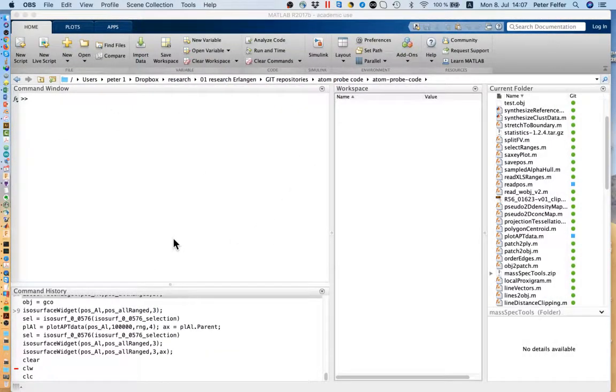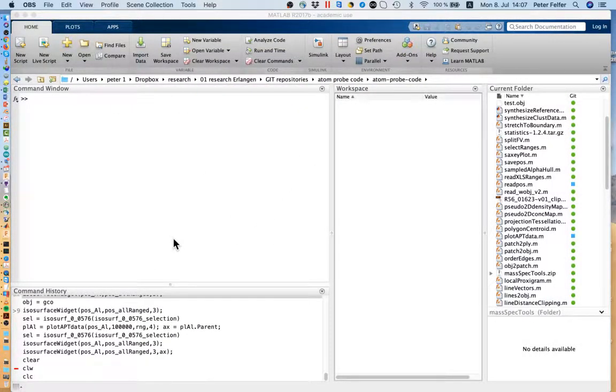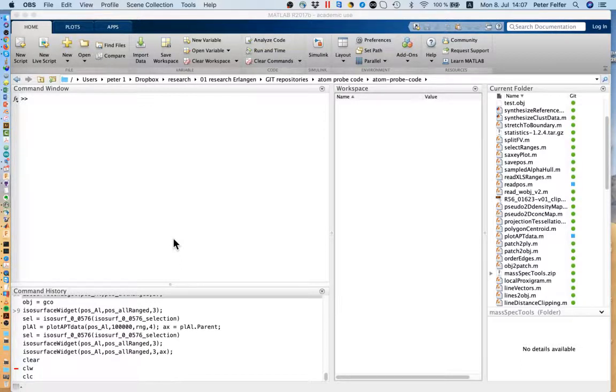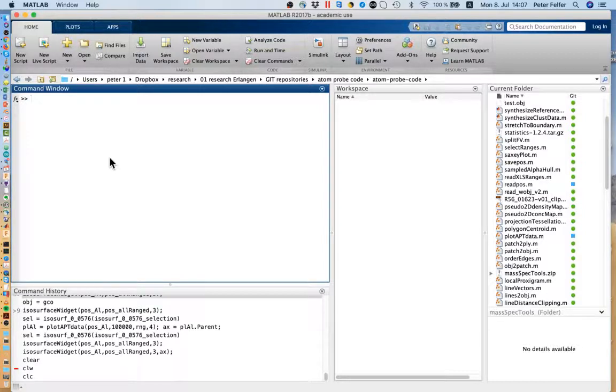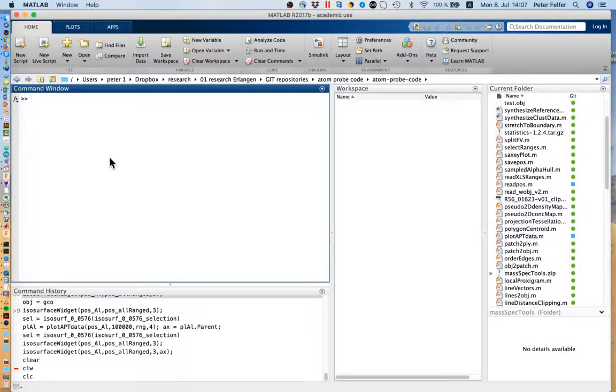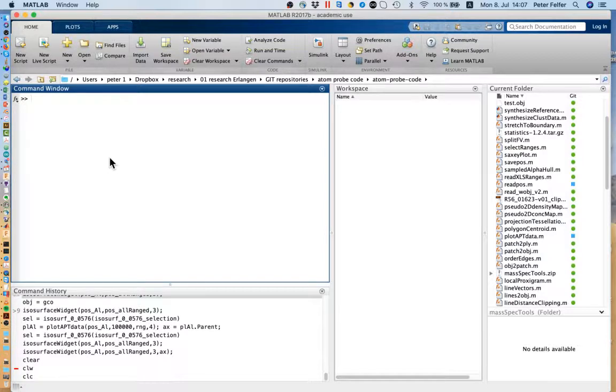Hi everyone and welcome back. I wanted to show you some cool new updates I've made to the atom probe code for analyzing atom probe data in MATLAB.